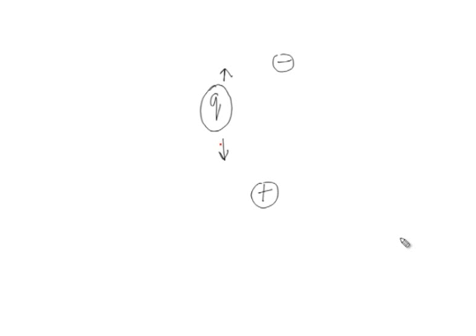As this charged molecule moves, it experiences a particular force, and this force is given by the electric field that is applied and the charge. So, E q, where E is the applied electric field and q is the charge. The force experienced by the charged particle under the influence of the electric field is E q.